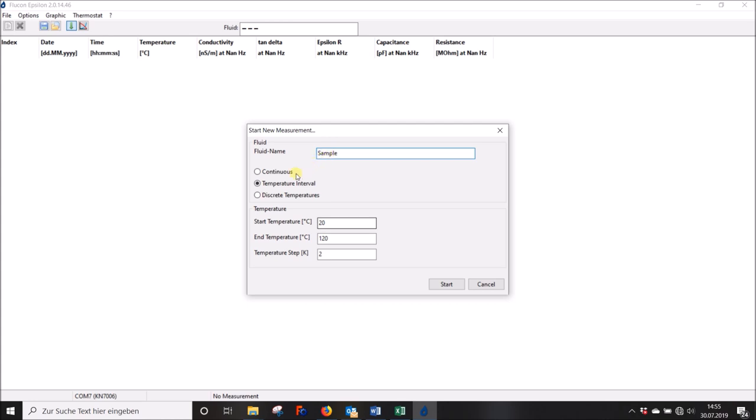Next, you can select your mode of measurement. Select temperature interval for your automatic temperature dependent measurement. Now type in your temperature settings such as the start temperature of your run, which should be above your actual temperature, the end temperature of your run, which should be below the flash point of your substance, as well as the temperature increments.